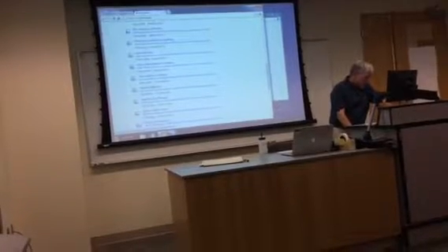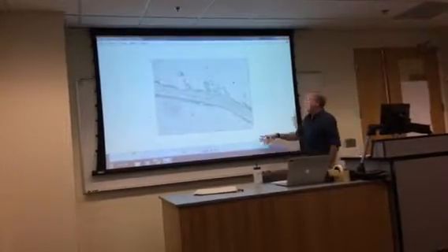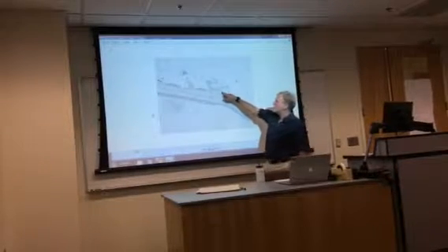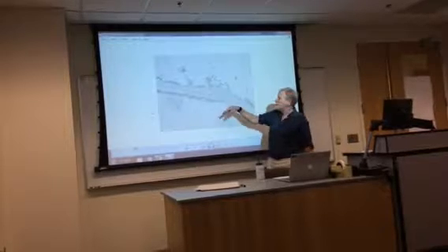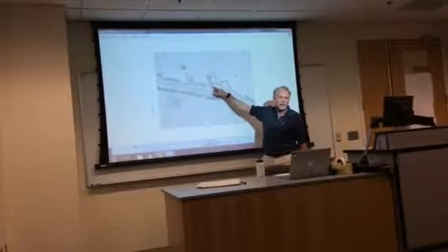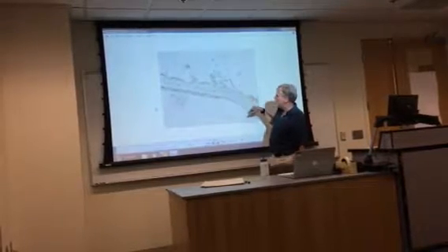of that. Thallus. All right, this one's upside down too. There's scales and rhizoids. The scales are multicellular. The rhizoids are unicellular. In most cases, they're coming at you through the plane of the section, so you just see a little circle that's cut in cross-section. Rhizoids are single cell, scales are multicellular.